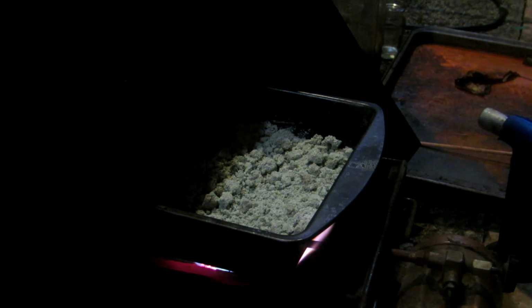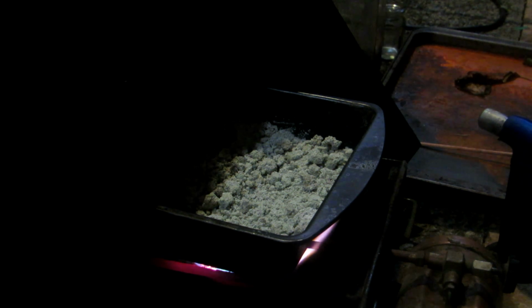Okay, so at this point, it appears that almost everything's reacted. It got to a point where it was very viscous and slurry, and then it hardened up. This is because now all we have left is sodium silicate, a bit of sodium hydroxide that perhaps didn't react, and a bit of sand that also perhaps didn't react. So, we can now go ahead and transfer all of this into some other sort of thing, such as a large beaker or a large canning jar or something. So I'm going to take this off heat, move it all to a different container, and then I'll meet you back for the next step.